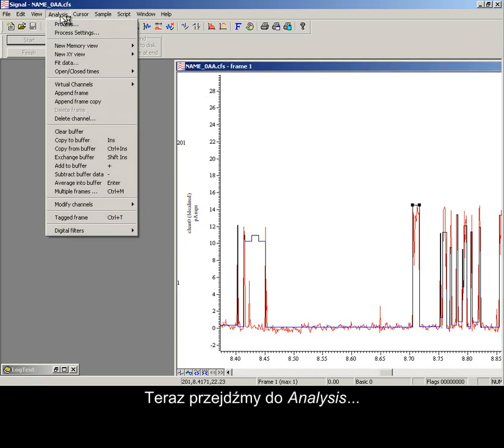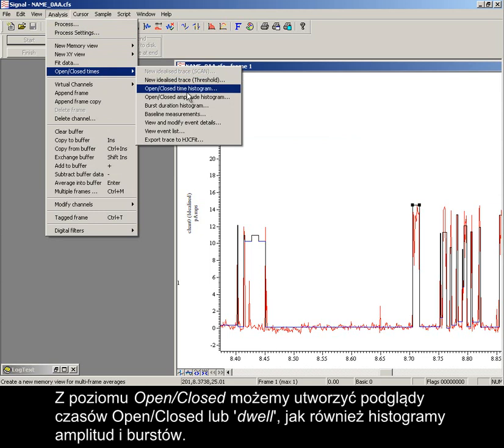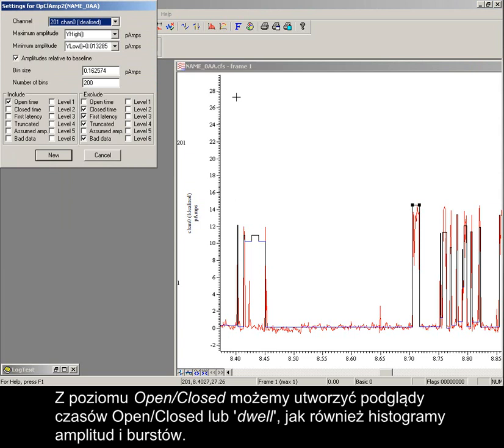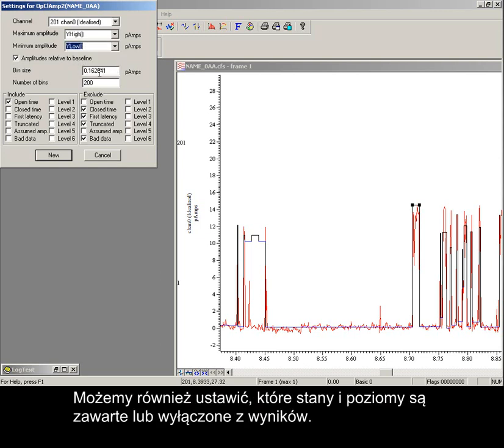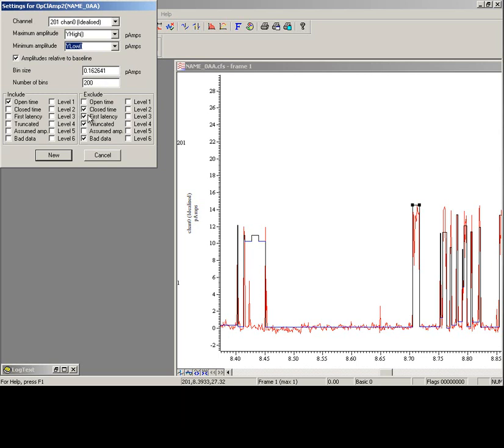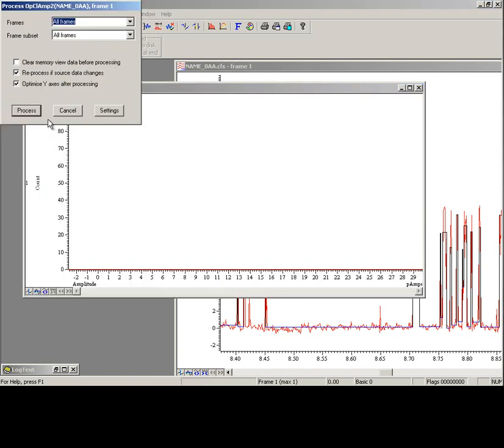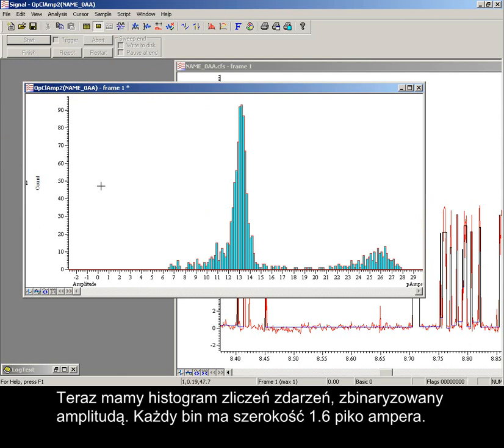Now onto analysis. From the open-closed times item, we can produce open-closed time or dwell result views, as well as amplitude and burst histograms. The settings dialog for this amplitude histogram allows setting of min and max amplitudes to include. We can also set which state and levels are included or excluded from the result. Now we have a histogram of the count of events, binned with amplitude, each bin spanning 1.6 picoamps.